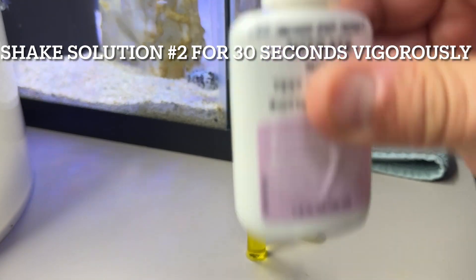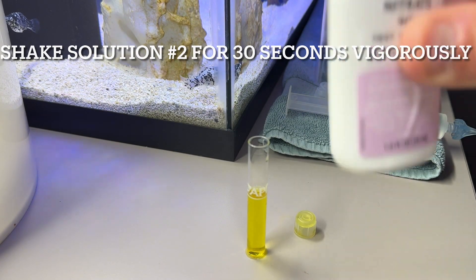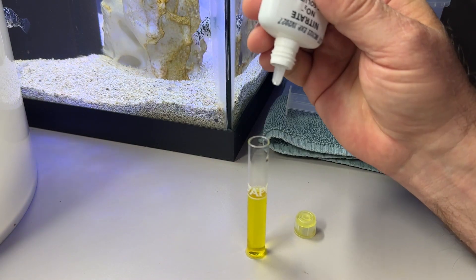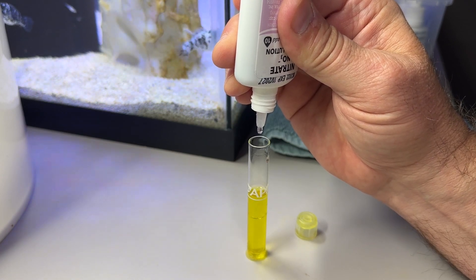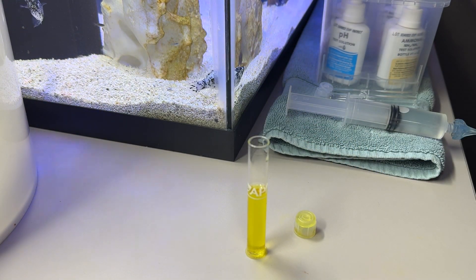Before we add test solution number two, we're going to take the bottle and vigorously shake it for 30 seconds. I've already done so, so I'll come back to you on this. Now we add ten drops: one, two, three, four, five, six, seven, nine, ten.